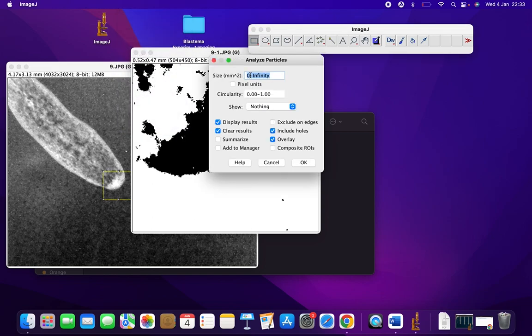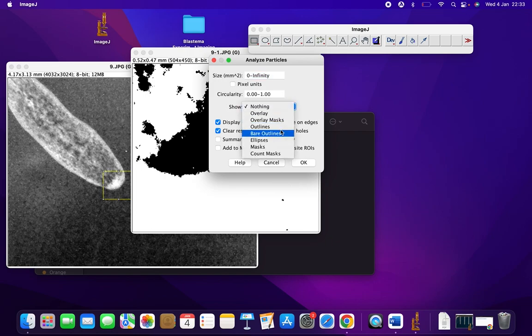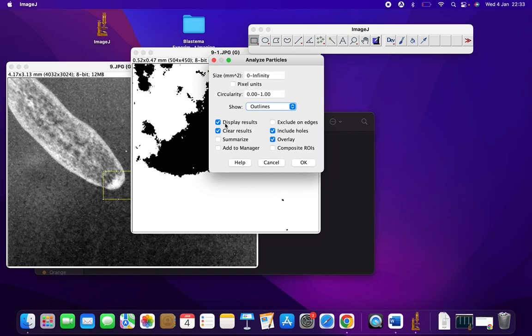For size, select 0 to infinity. Under Show, select Outlines. Also ensure that Display Results, Clear Results, Include Holes, and Overlay are selected, and press OK.